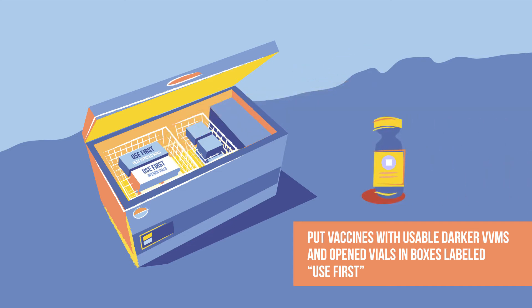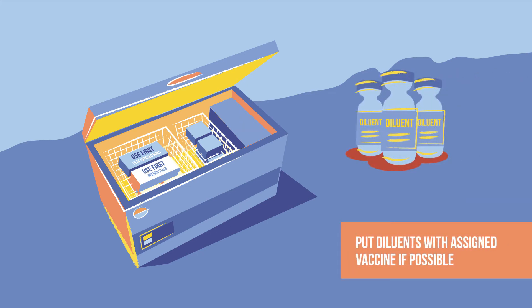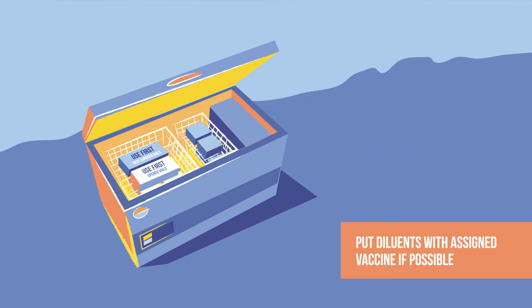This same thing is done with opened, multi-dose vials approved for use in a later session. Notice these boxes are placed in the top baskets. Diluents are placed with their assigned vaccine. Where this is not possible, diluents are clearly labelled and placed in the top baskets.